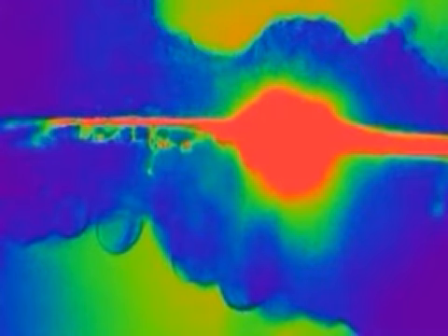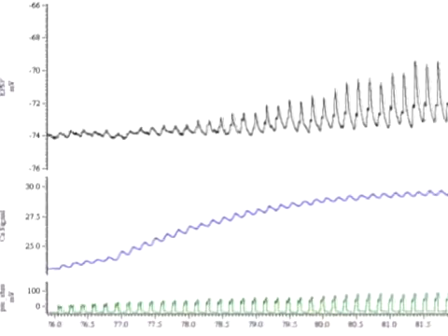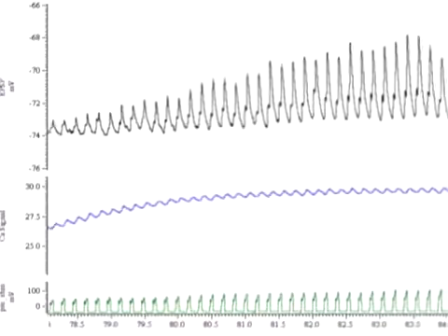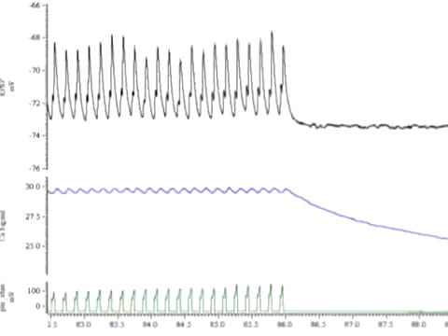Intracellular calcium has been implied as an important part of several mechanisms of synaptic plasticity. These ideas can be tested by simultaneously monitoring changes in calcium and alterations in synaptic efficacy. Here we demonstrate how this is accomplished by combining calcium imaging with intracellular recording.